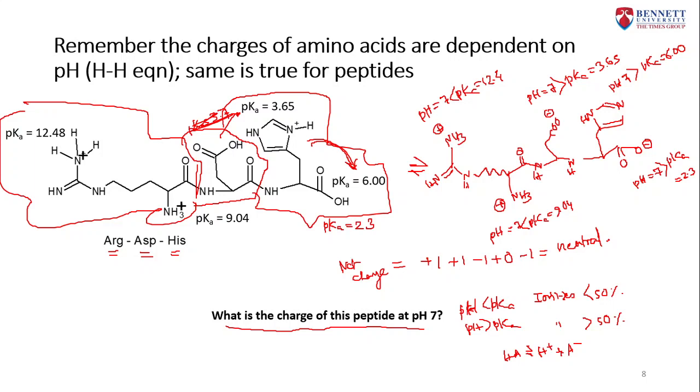But if you increase the pH more, some more groups will ionize, and you can calculate the net charge. If you want to do a more quantitative calculation, you have to use Henderson's equation to find out what exactly it is. But this is the basic chemistry.